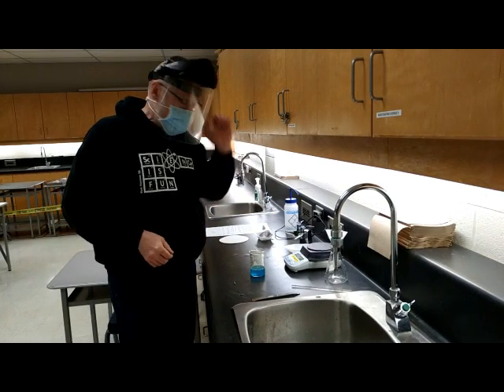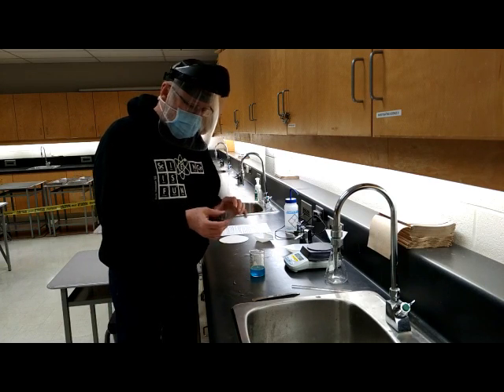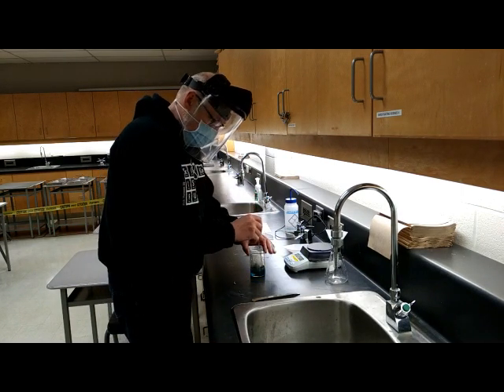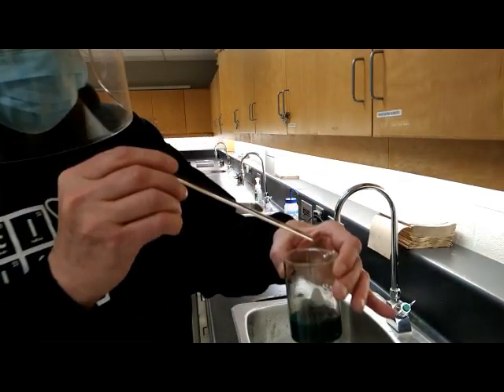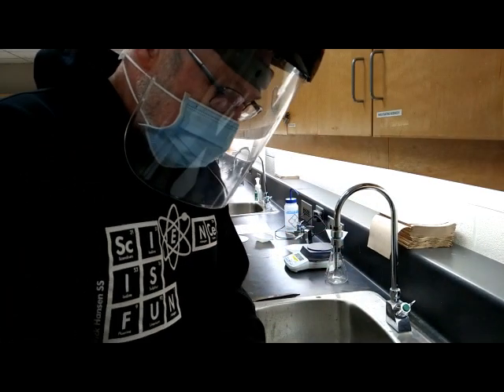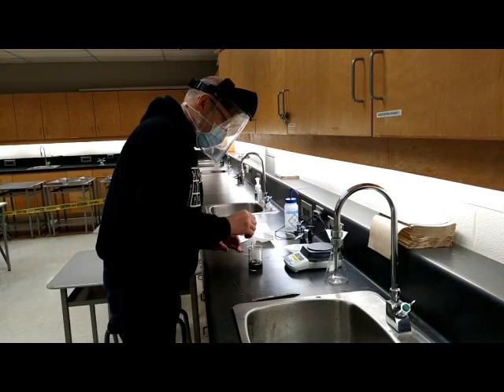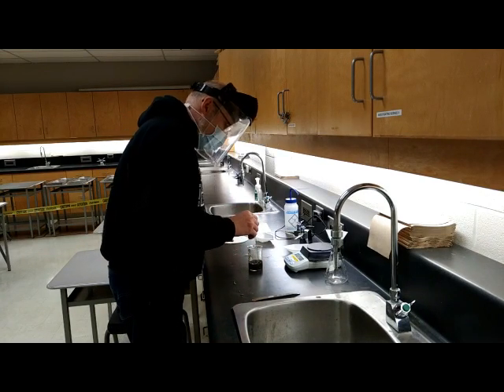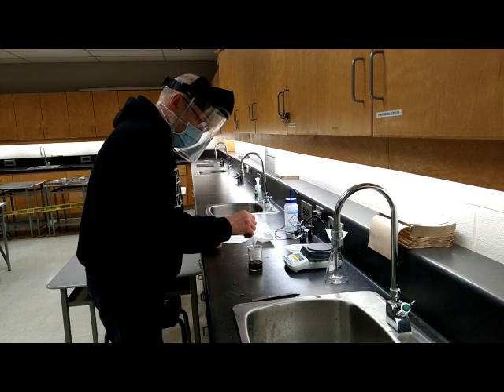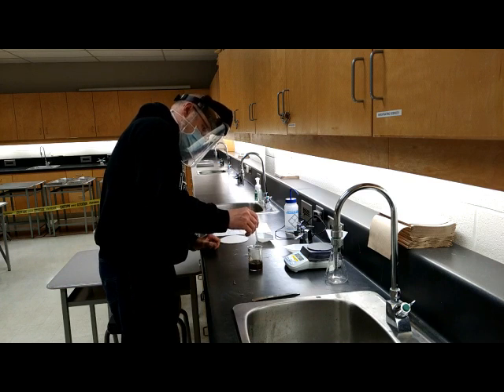And this is actually fairly straightforward. All we're going to do is put the 1.00 grams of steel wool into my container and watch the reaction go. So I'm going to bring this a little closer so you can actually see it. And if you look carefully, you can see there is already a little bit of brown color on the steel wool, and that is the copper forming. Oops, put this back over here. And we'll stir that around until all of the copper has formed and all of the steel wool has been converted to iron 2+ ion.